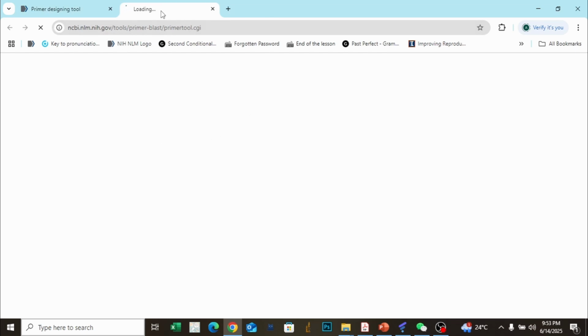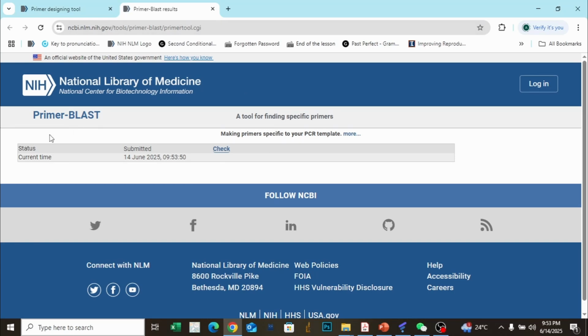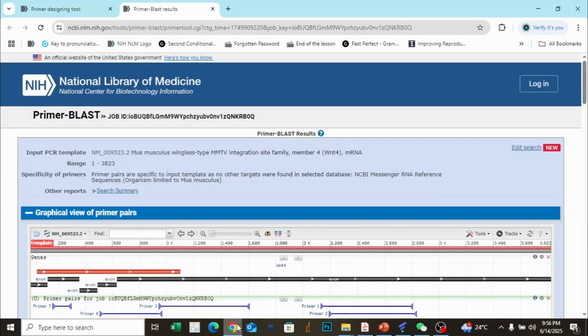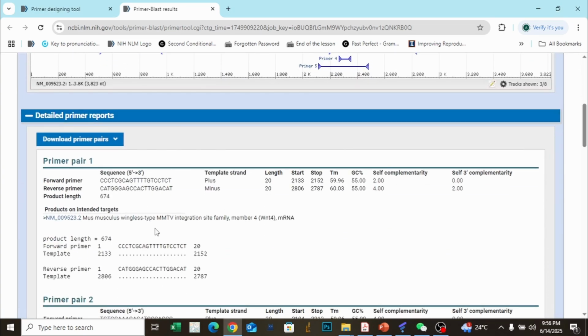Now it has been started, just like in a new window. Now if we look at the status, current time, the primer is being designed, so we need to wait, and once finished we come back. Now let's check. Okay, it has been completed. A series of primers has been designed for us.